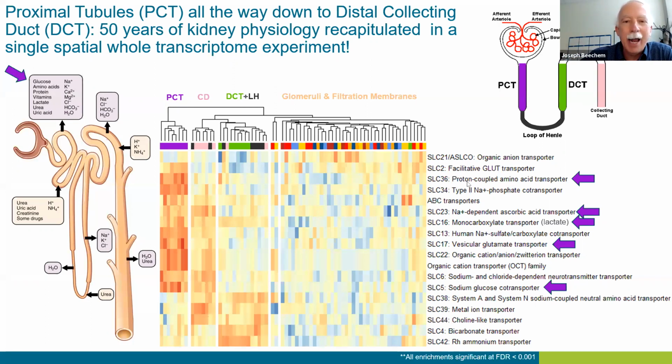And then look at your right, you're just plotting out the highest scoring pathways that I'm getting when I'm in that PCT, that proximal tubule, and you see things like sodium phosphate co-transporters, sodium ascorbate transporters, and so on and so forth. And if you actually go back through all the textbooks on kidney physiology, these are exactly all the transporters that are supposed to be in that little proximal convoluted tubule region.